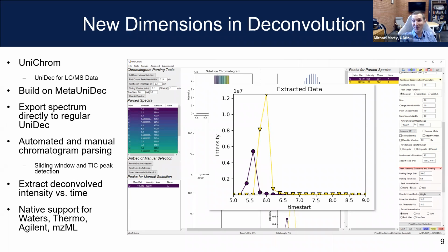And if you have ideas for ways to build on this, it's all open source and we'd love for people to play with it. All the data is there, so you can do anything you want with it. And it's all stored in this HDF5 file, which is a nice open format that you can read in. So yeah, that's cool. I would say there are rudimentary tools for doing it, and we can play with that and take a look at it. Any other questions on this? We can definitely take a look during the demo.